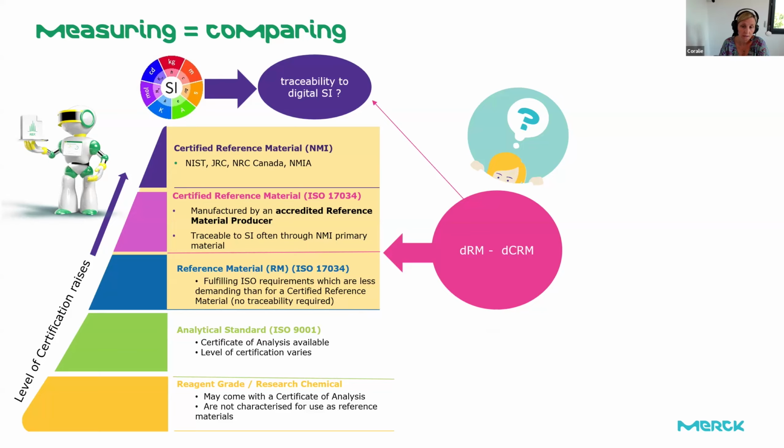We have to distribute them. Know as well that depending on how your lab is audited or certified, it may be mandatory for you to use those reference materials. And this is where we would like to place digital reference material. That is in this higher level of trust, where we can give, if possible, directly the data and not just the physical reference material.